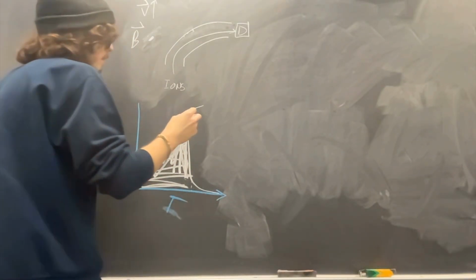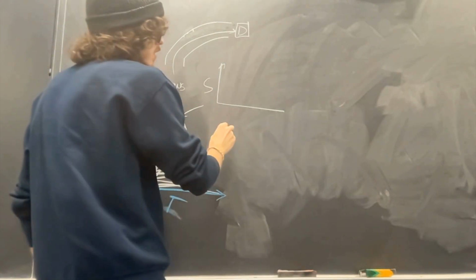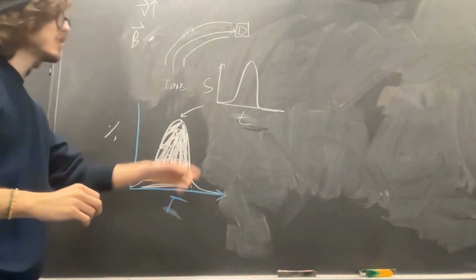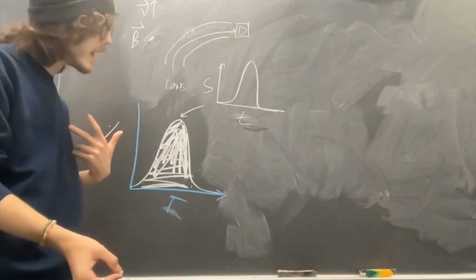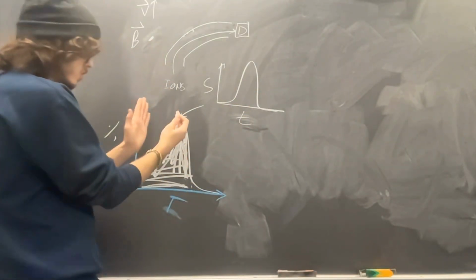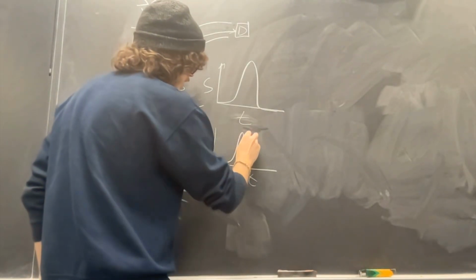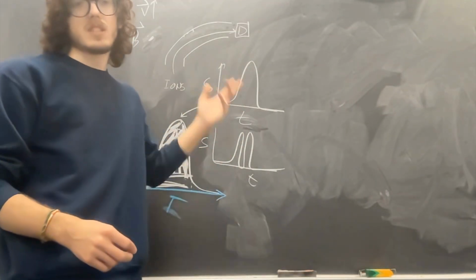Because what's going to happen is that if we look at our signal with respect to m over z, or I should say time, you're going to see this huge broad band, and that's not good, because if you have ions of very similar size, you might overlap a peak. If we restricted the amount of kinetic energy, and we have 2 analytes very similar in their mass, you might be able to resolve that peak that you're supposed to see, whereas here we didn't really see that.